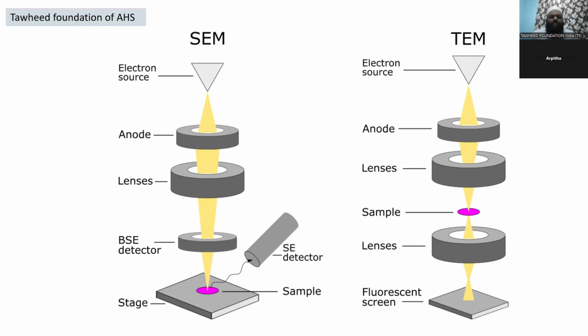Industrially, electron microscopes are often used for quality control and failure analysis. Modern electron microscopes produce electron micrographs using specialized digital cameras and frame grabbers to capture the images. The science of biology owes its development to the electron microscope. The study of microorganisms like bacteria, viruses, and other pathogens has made the treatment of disease very effective.